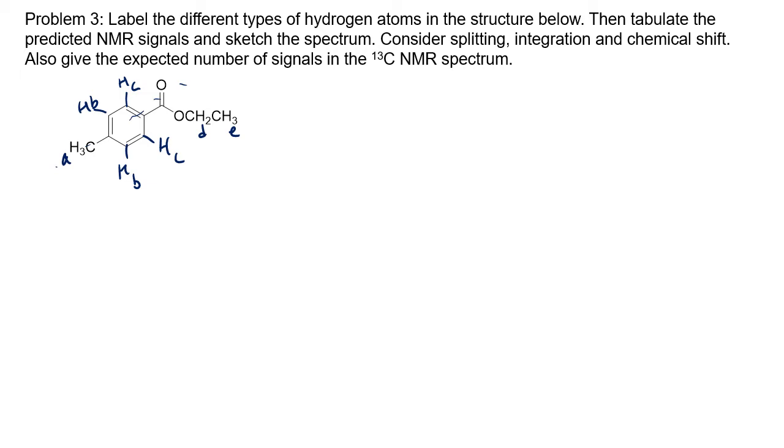Okay, so if we go and look at the expected signals, we're going to look at the type of hydrogen, and we're going to look at the chemical shift in ppm. We're going to think about the integration and the splitting.